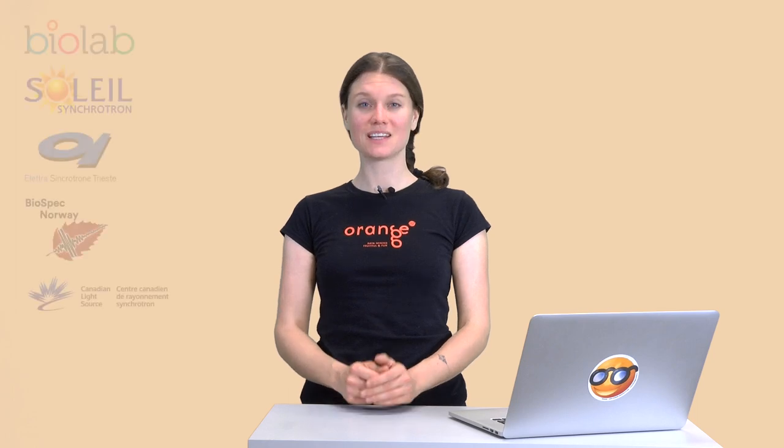Hi! You are here to learn about Spectral Orange. This is a collaborative project aimed at developing an add-on for Orange that allows data analysis of hyperspectral datasets.